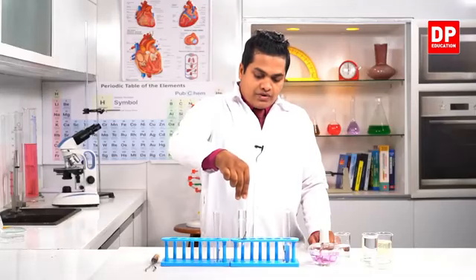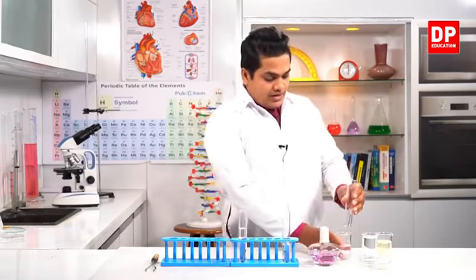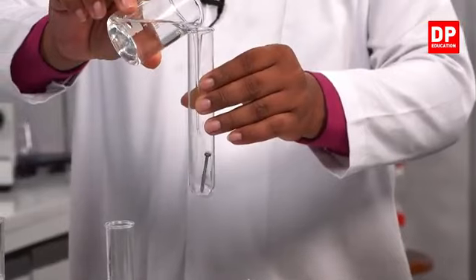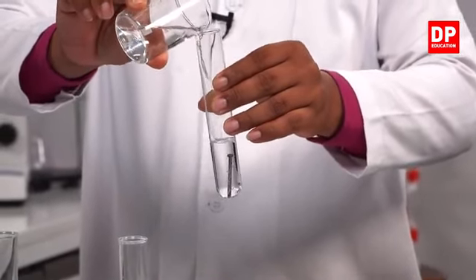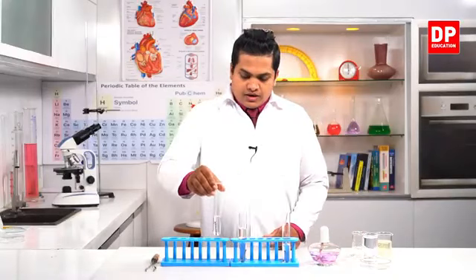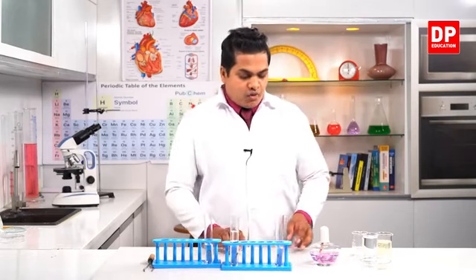Okay, now the number 3, third boiling tube. In the third boiling tube, there is an iron nail, you can see it. I'm going to insert water to cover up the iron nail. Then I'm going to heat this boiling tube very well until the water boils.